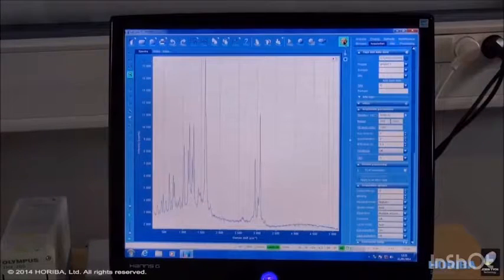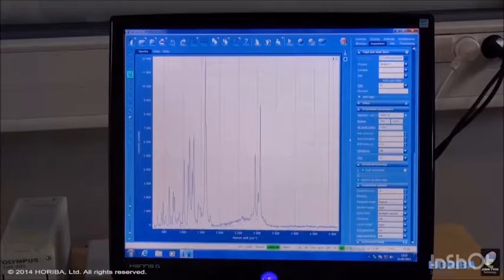So I will activate this option and I will launch again a real-time detection to see the changes. It can be easily observed that the background is almost eliminated. Now we have a very nice baseline.